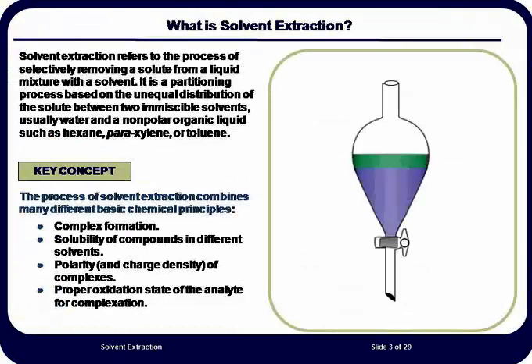The key concept to take away at this point is that the process of solvent extraction requires that the chemist adjust the solution conditions so that the radionuclide of interest is in the proper oxidation state, so that the solution pH is adjusted appropriately for the extraction, that the appropriate complexing agent will form the appropriate complex with the radionuclide of interest, and that a neutral complex that will easily migrate into the organic phase based on those chemical conditions is formed.